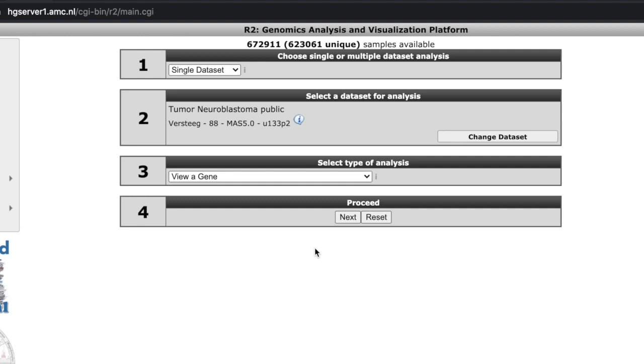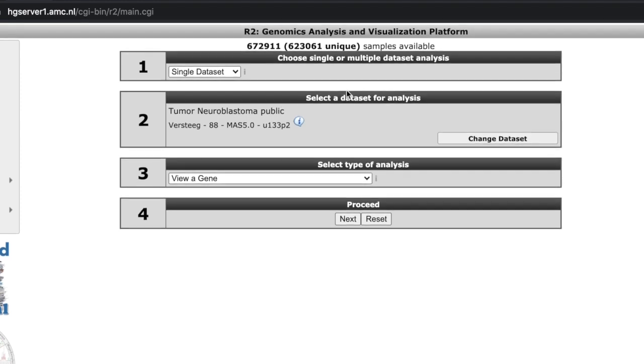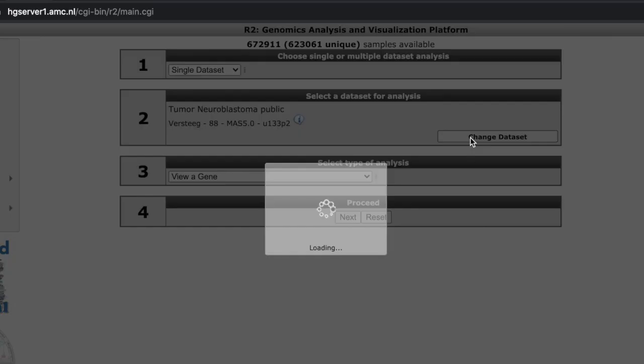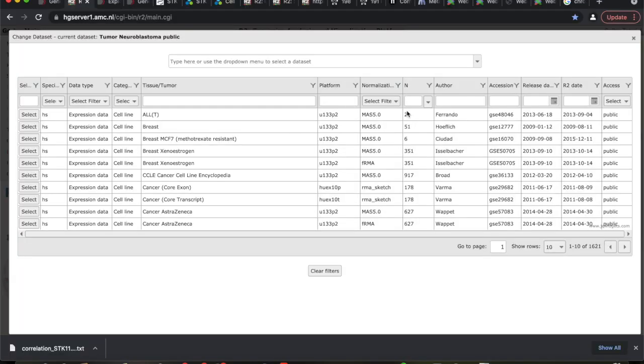So what we're going to do now is we're going to mine some of this data. We're going to generate our own data set. On this first page you can see single data set. I want you to click on single data set. We're just going to choose one data set. Select a data for analysis. I want you to click change data set.